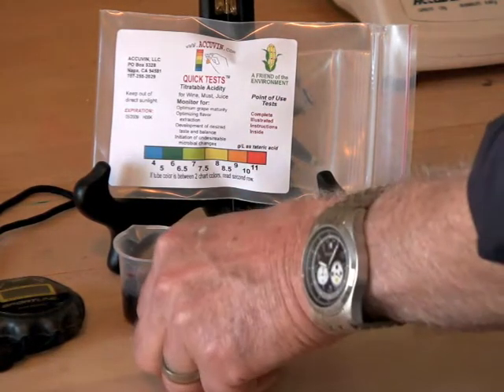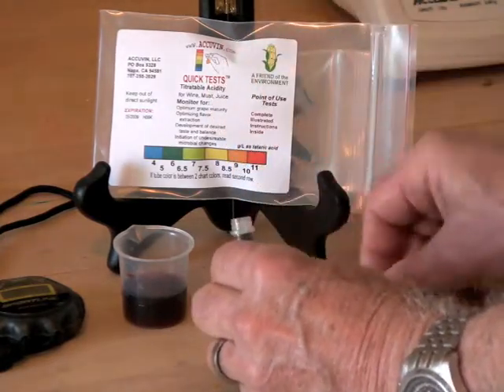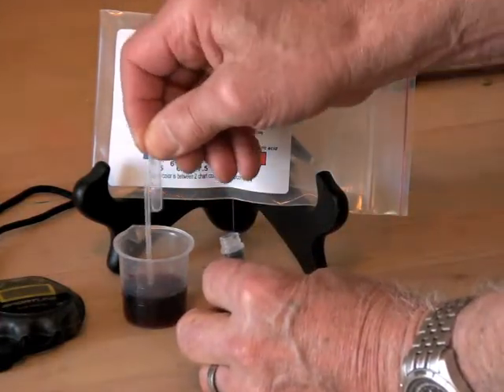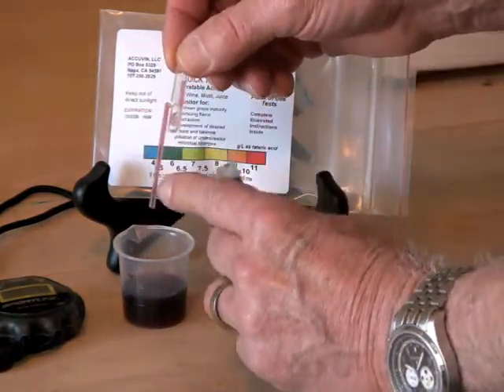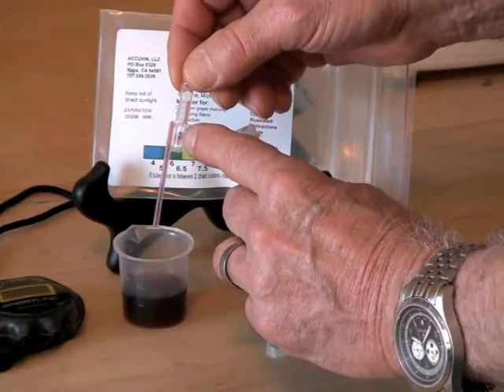To run the test, remove the cap from the reagent tube. Hold the sampler by the top bulb, squeeze once, place the tip into the wine sample, release it, and withdraw it. The sample is contained in the straight portion; the center bulb contains excess sample.